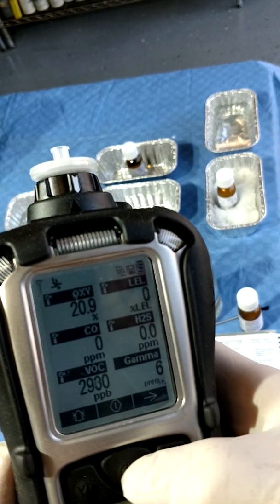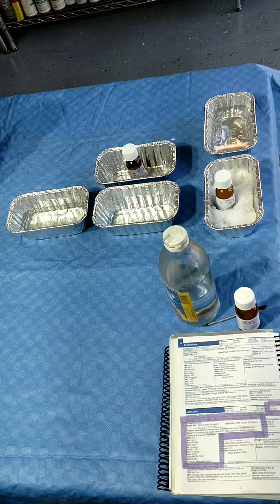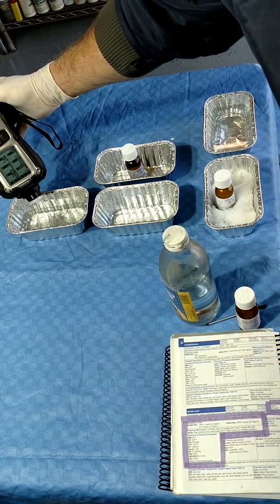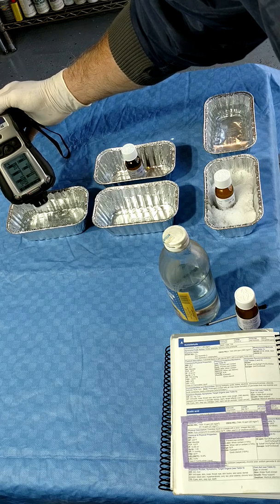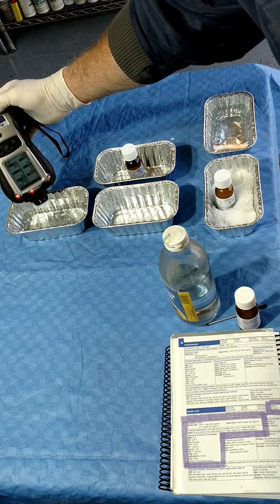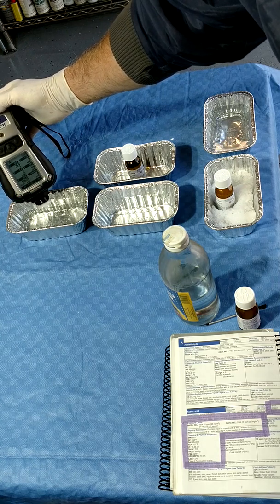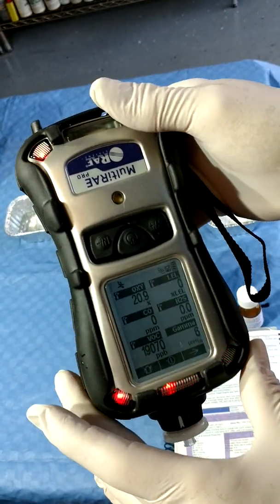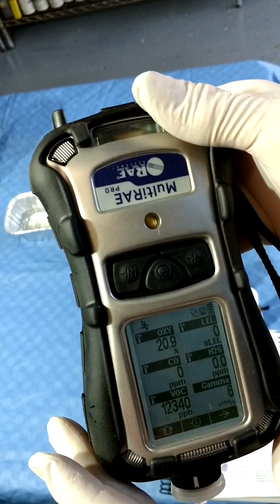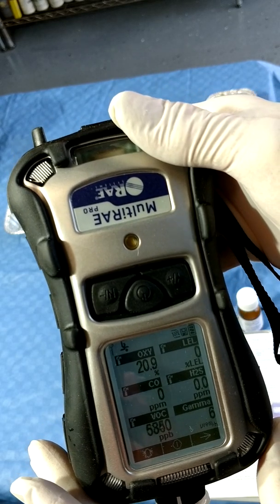Okay, now we're going to get a sample off of the vinegar. And we can see that the vinegar peaked at around 18,000 ppb, and the LEL still remained at 0%.